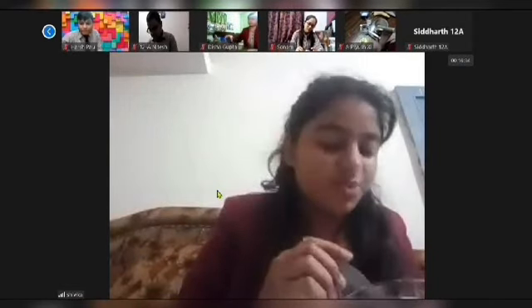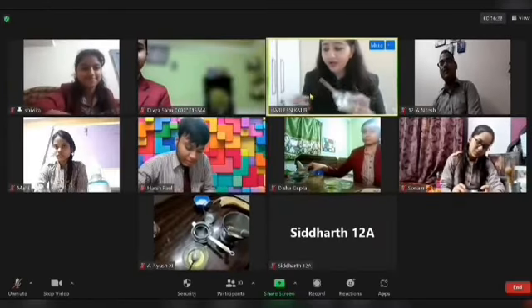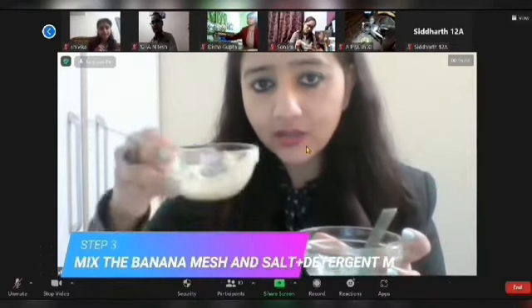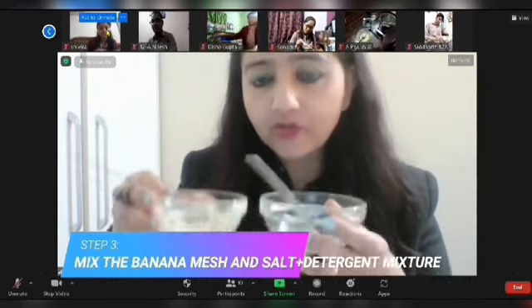So what will be our next step? Now you have to add equal amount of banana extract into the extract which you have prepared. The banana extract and the salt and the liquid detergent extract we are going to mix.